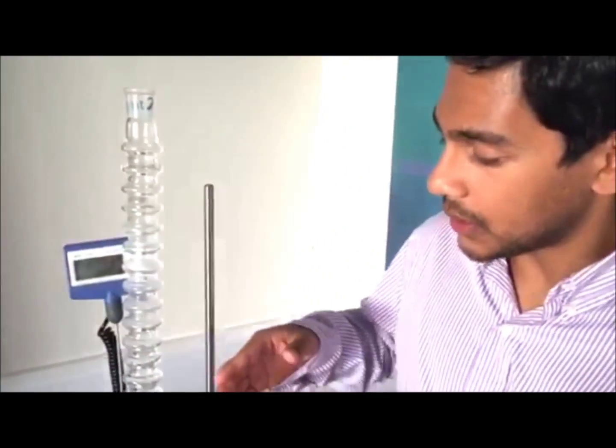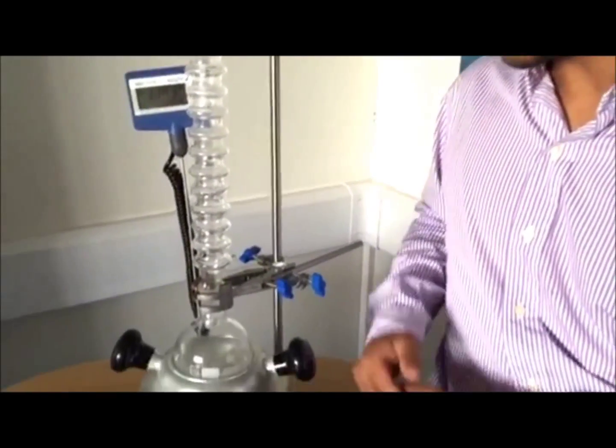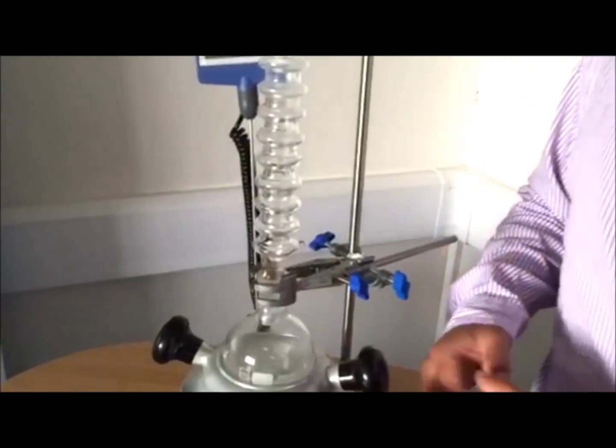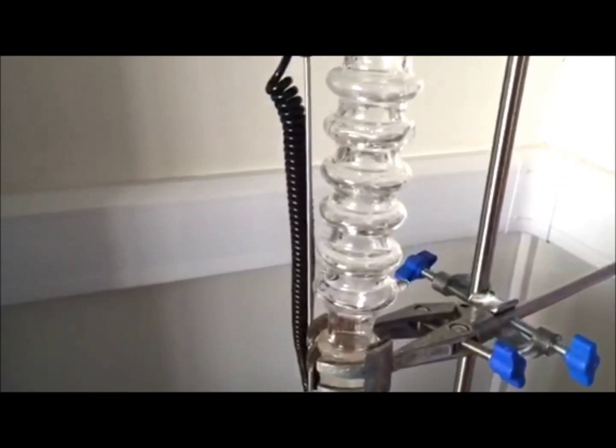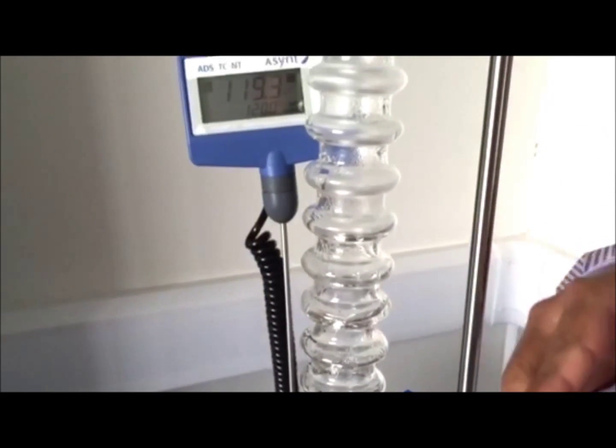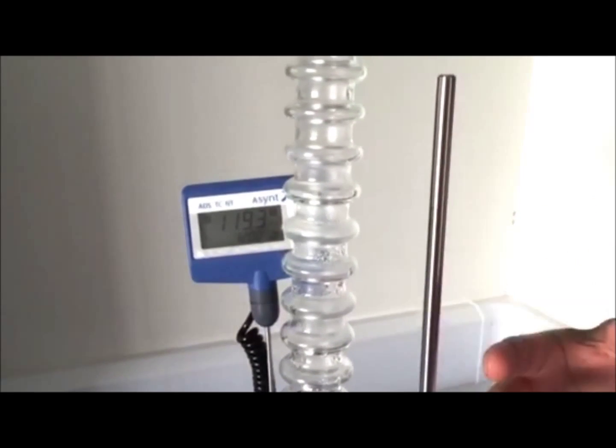We've got a design which is designed to extract the maximum energy from the vapors and get efficient condensing due to the different flows which the gases go through from laminar to turbulent, laminar to turbulent.